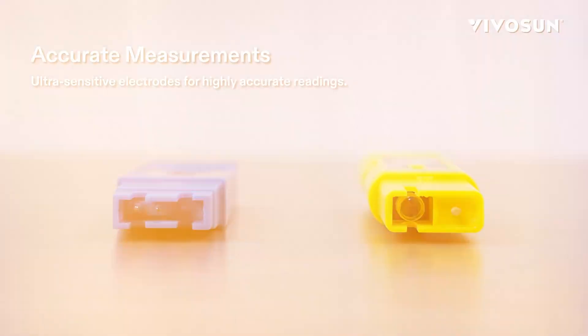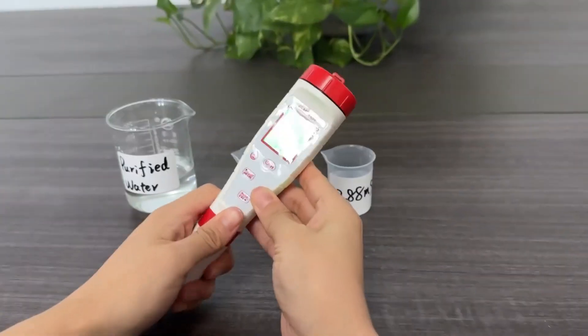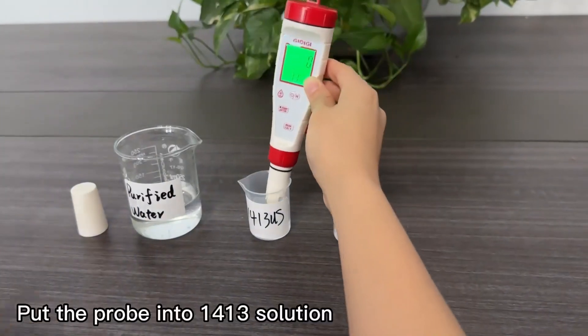In this video I will show you the three best digital pH and TDS meters in terms of value for money this year. I have already done the research for you to make the ideal choice.